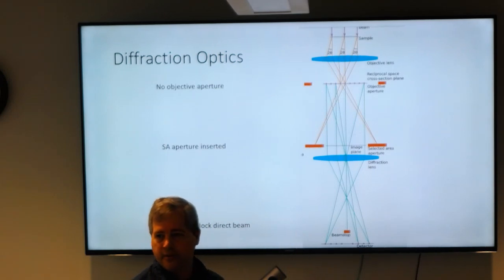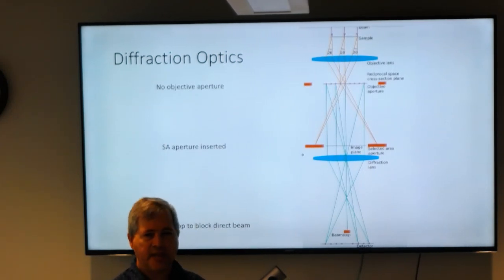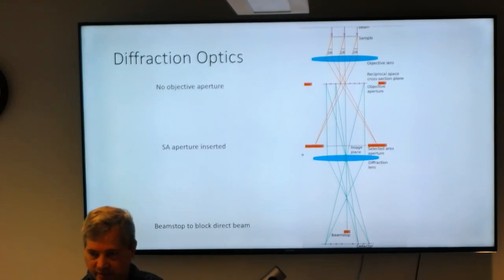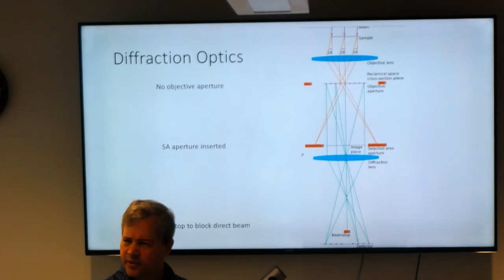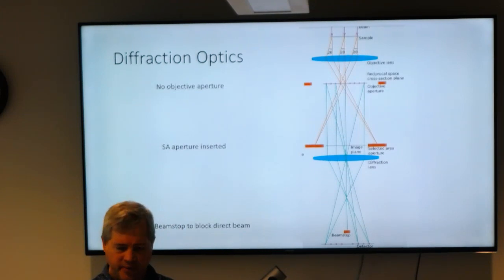Even a CMOS will burn out? The non-direct ones are less sensitive, but I wouldn't want to keep collecting diffraction patterns on it all day. Eventually it would probably not be so good for it. The direct detectors are also CMOS, and they would burn. I thought the CMOS did have an ability to absorb it. Not enough. Like the non-direct one, the TVIPS one, it's okay without it.